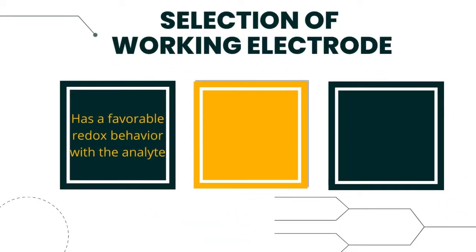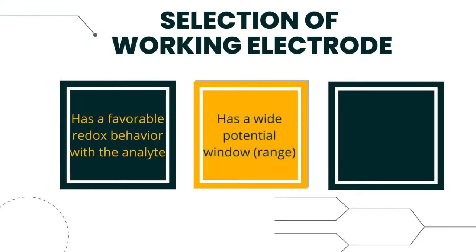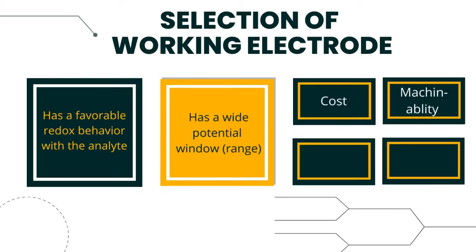One of the important factors in selecting the right working electrode is the material should have a favorable redox behavior with the analyte. The electrodes should have a reproducible potential and fast electron transfer, and no fouling should occur. Besides, it should provide a wide potential range. A different analyte characterization can then be performed. The cost, toxic level, machinability, and convenience of renewing electrode surface are some other factors needed to be considered too.